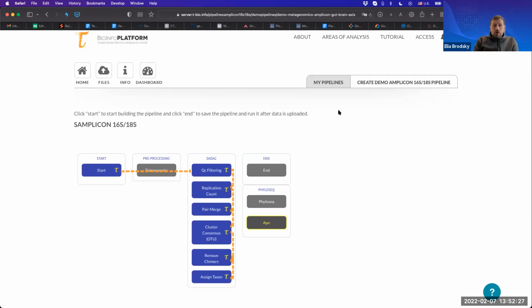From this point on, we essentially have several different tables. Those tables include a table of OTU abundance, or how much of a particular operational taxonomic unit I have proportionately in each sample, and the annotation of where that OTU maps to from the reference database.